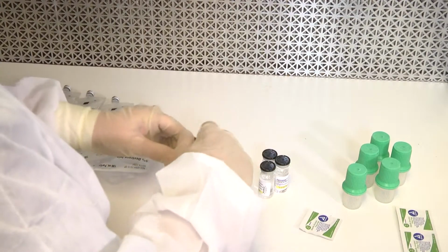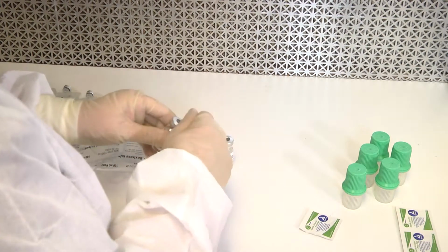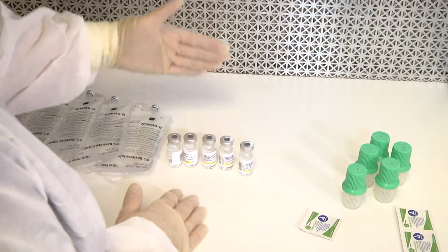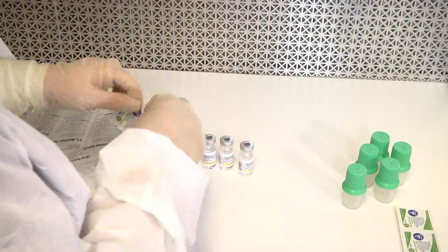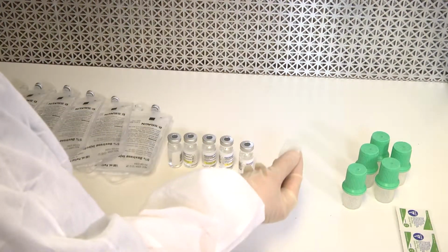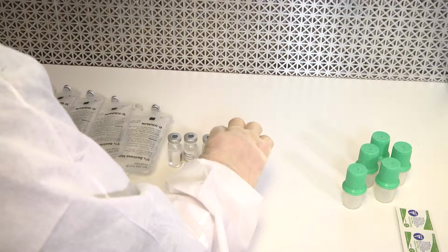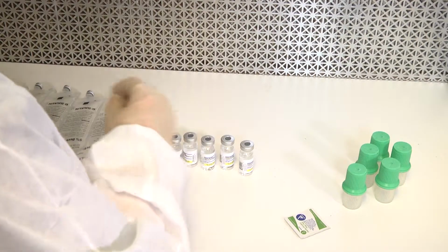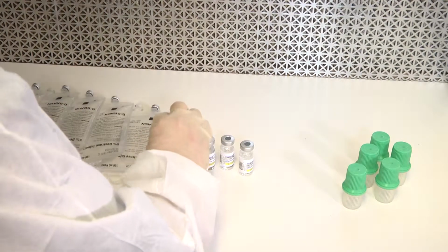I'm going to open each vial. Again, with everything, we don't want to shadow once we clean them. That means my hand cannot come between the HEPA airflow and the tops of these vials, which is a critical point. And I have to clean them each with a swab. I'll do the same thing, use one swab per 2, because you definitely want to make sure you get any particles left behind from the manufacturer. Not blocking the airflow of the IV bag or the vials. We're ready to go.